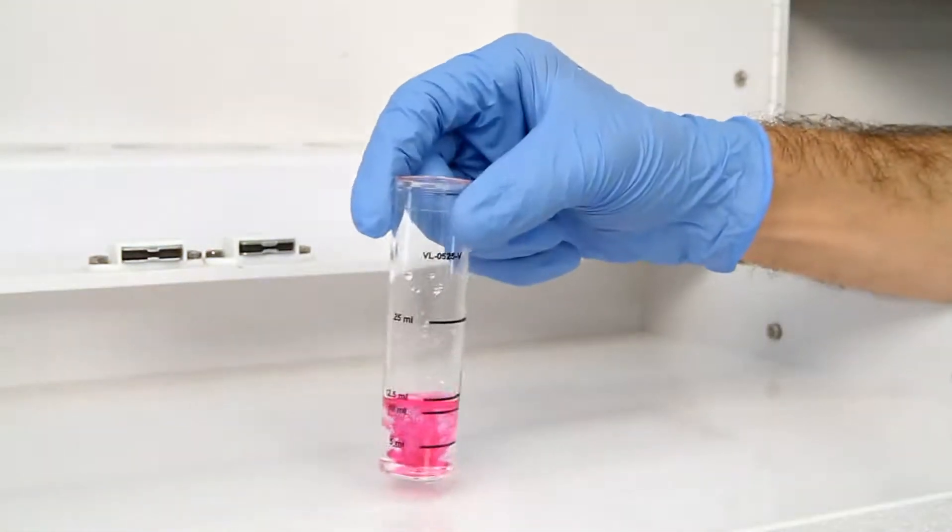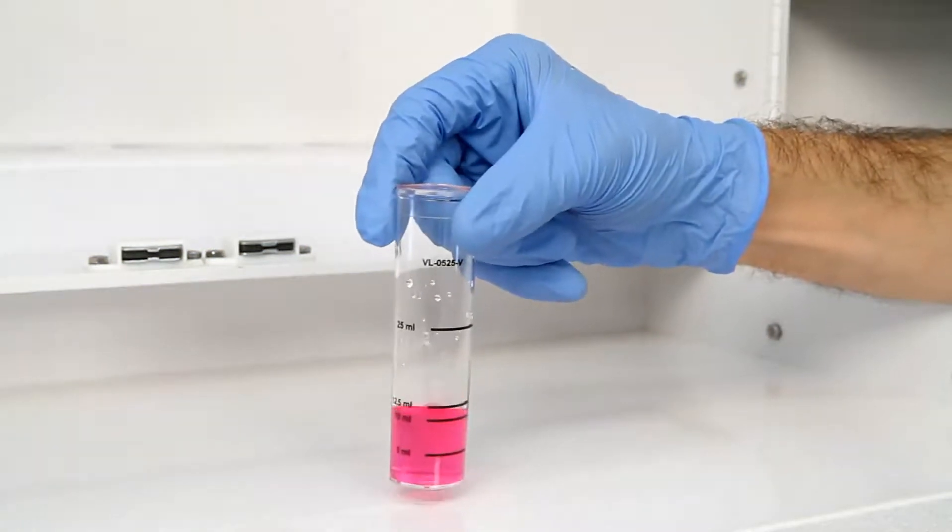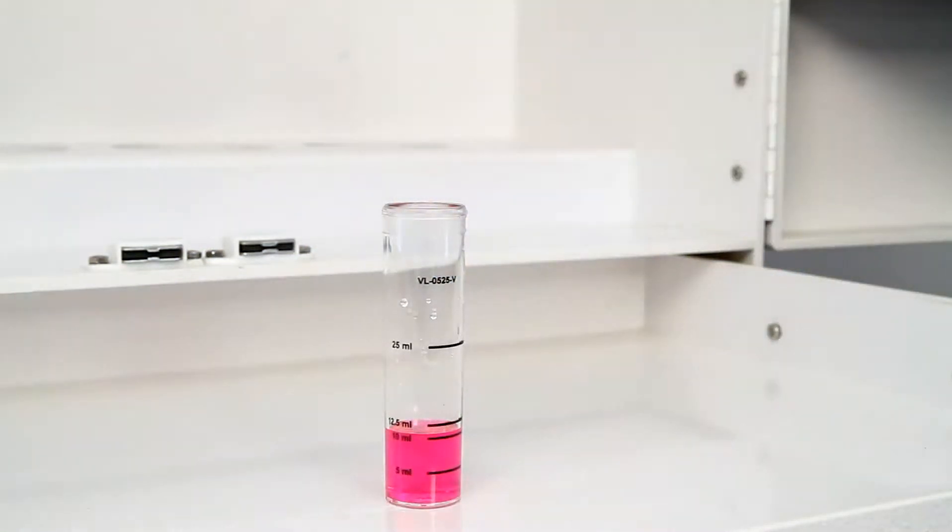After the addition of each reagent, it's important to swirl the vial to make sure the reagents are properly mixed. In this example, the sample should turn red.